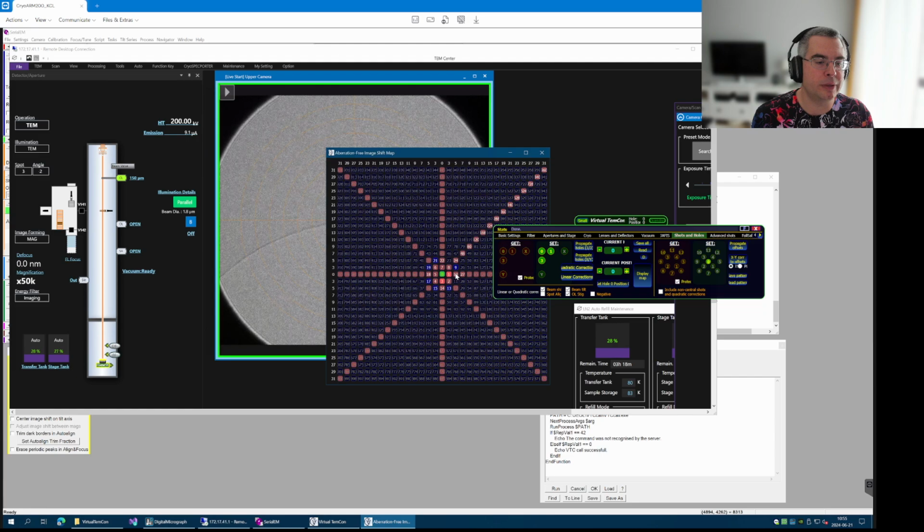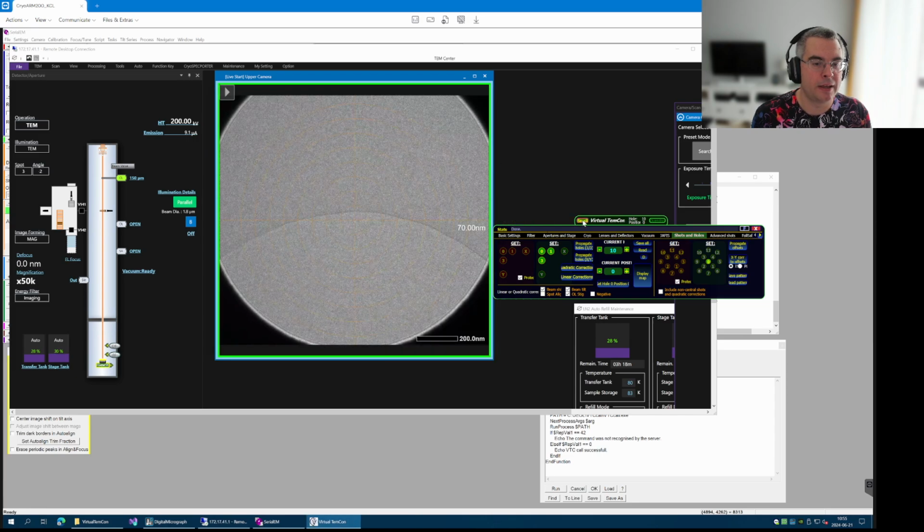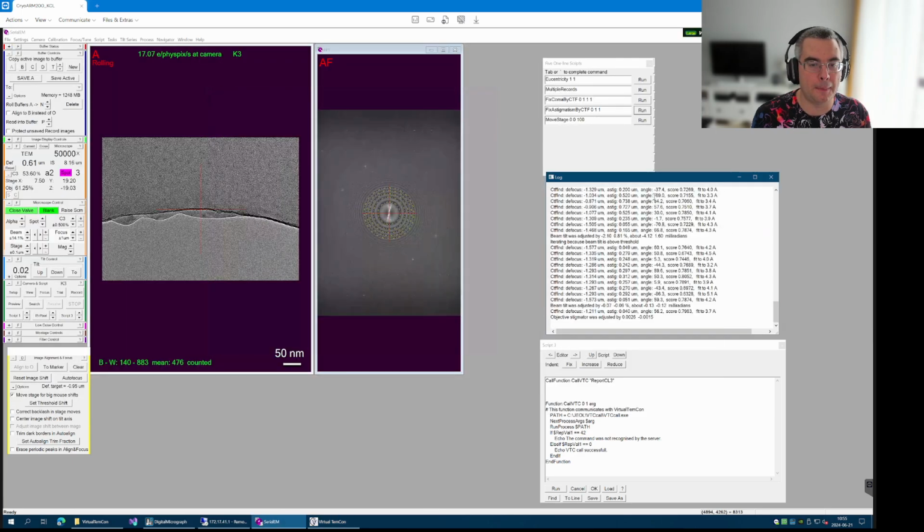Then we try to get to the highest possible, to the most distant hole in the X direction and Y direction. In this case, this is hole number 10. And for hole number 10, we have to do the same exercise. So fix coma.